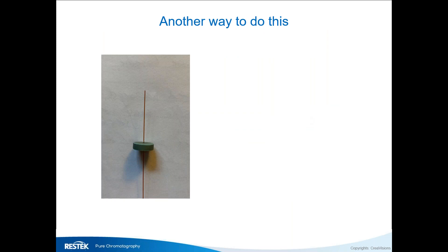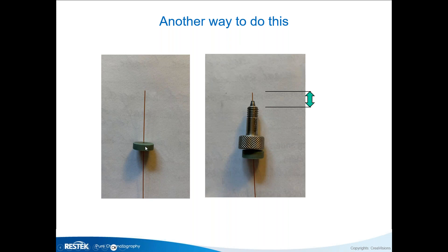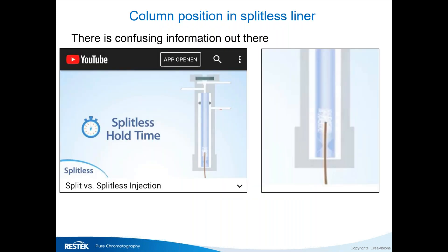Another approach is to take an old septum, slide it over the column, and then put the fitting onto that septum so it's held at a fixed point. You can cut a piece off the front, because when you stick a column through an existing ferrule some graphite may be squeezed off. Now you can adjust this length to the correct distance — check with your GC brand; for Agilent it's four to seven millimeters.